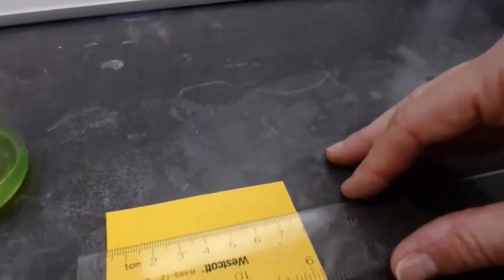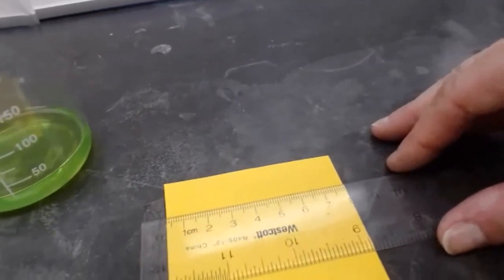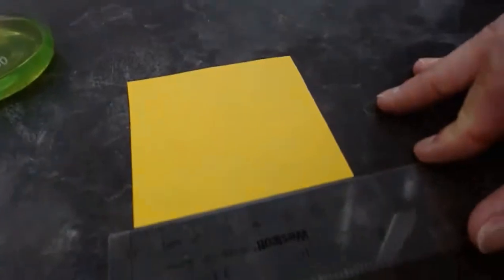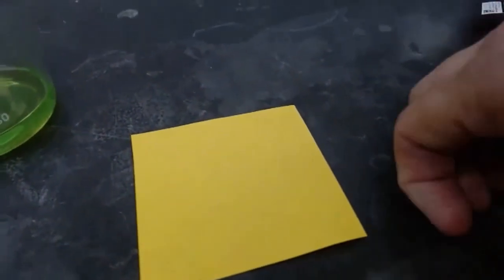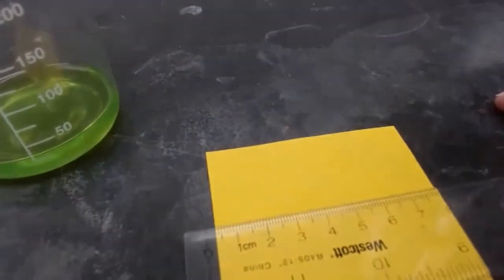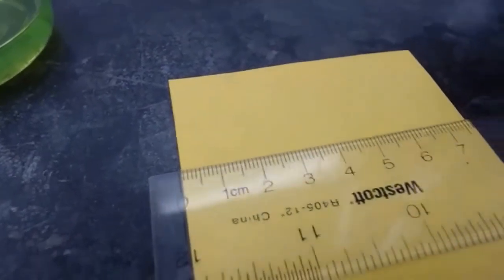So I'm placing it on top of the Post-it. So not the side of it where I'm trying to see where it is, but directly on top of it because I can see through it. You want to line up the end of the Post-it with the 0 line. And so there's 2 lines so you can get it square.